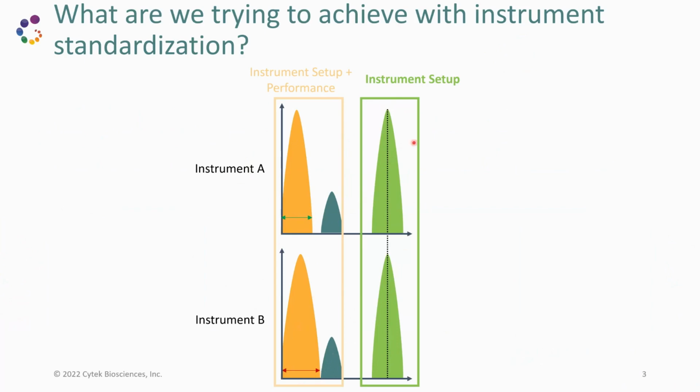So we're going to spend the first part of the talk talking about instrument setup, focusing on the positive part of the equation, the green population in this schematic. And later in the talk, we're going to tackle what is going on at the low end.